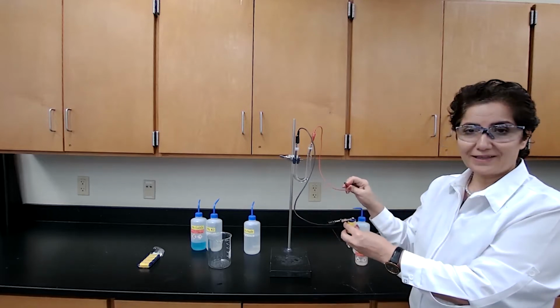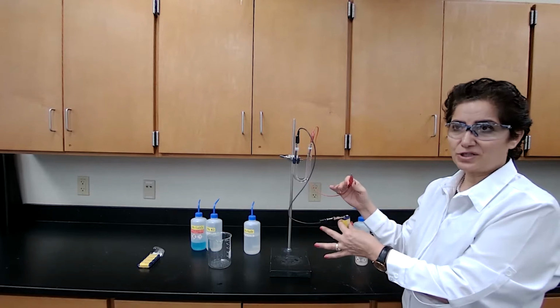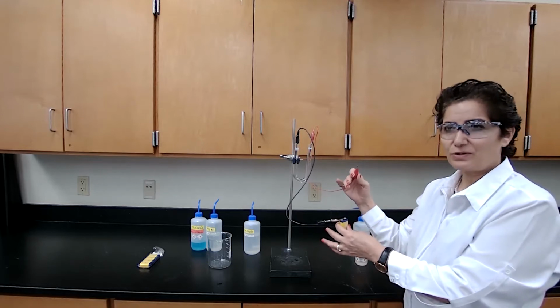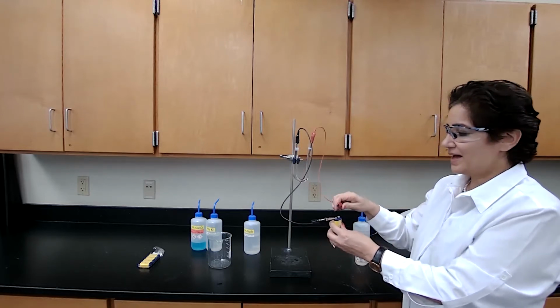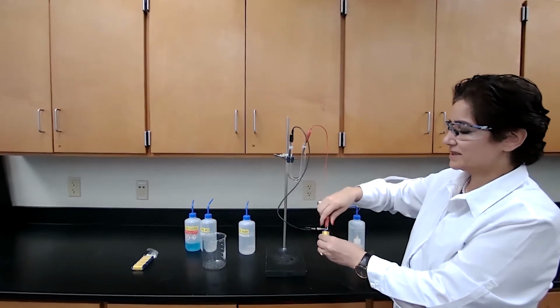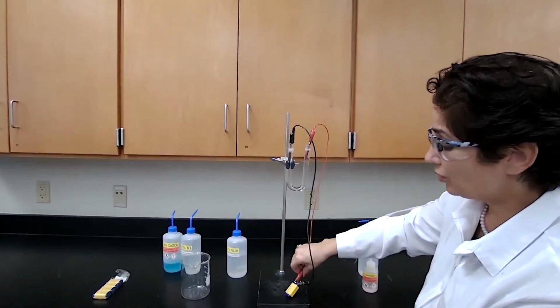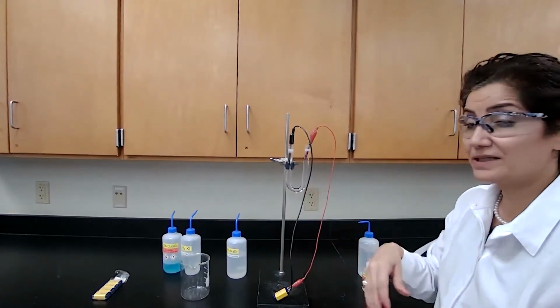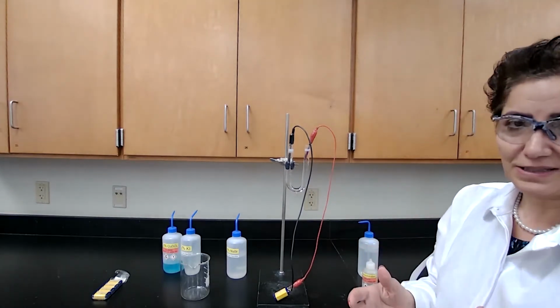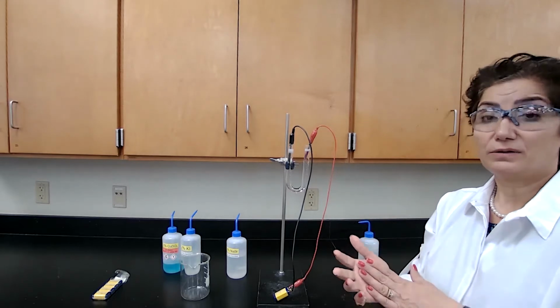To understand this experiment, I want you to go back. When you read the procedure, it is not going to help much. So I want you to go back to the theory part and decide based on what is being analyzed, or what is being oxidized or reduced. Because in the theory part, I give you choices. You have a choice of two elements to be reduced.